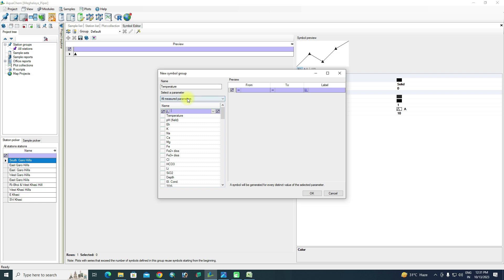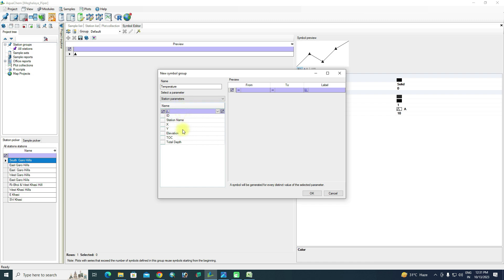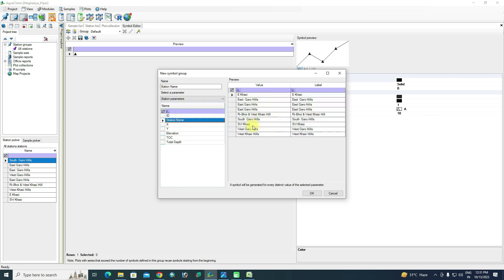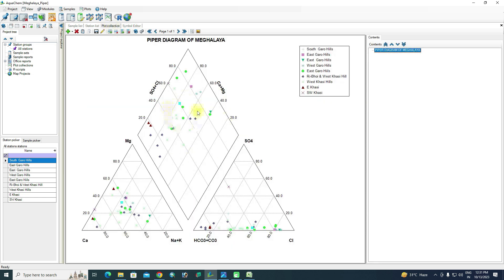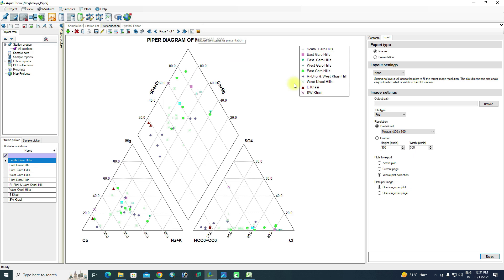Go to Plot Collection Symbol Editor. Select the box and first choose 'All Measured Parameters'. To display district names in the legend, go to Station Parameter and select 'Station Name' — this will show the district name. Click OK, then Apply. The legend now appears with district names.